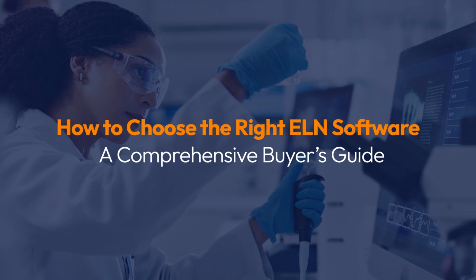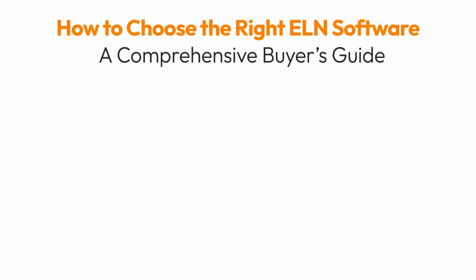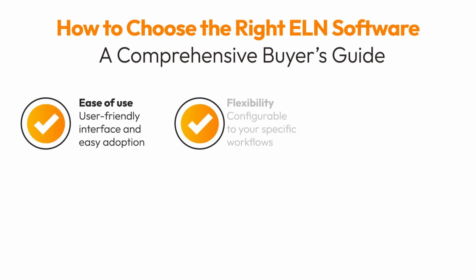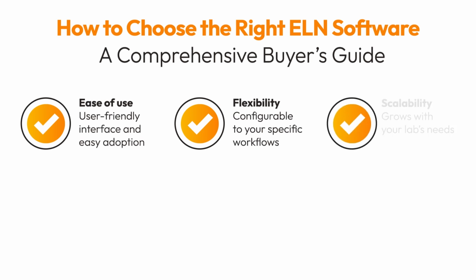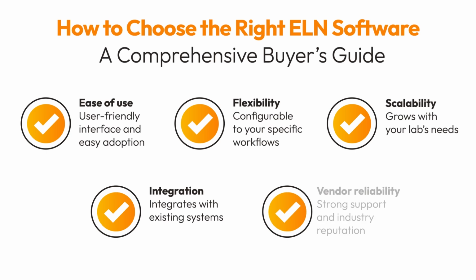Selecting the right ELN software involves understanding your lab's unique requirements. Consider the software's ease of use, no or low-code flexibility, and scalability. Choosing an ELN that integrates with your existing systems and adapts to your lab's evolving needs is equally important. Additionally, evaluate the ELN vendor's reputation, customer support services, and the total cost of ownership, including implementation and training.